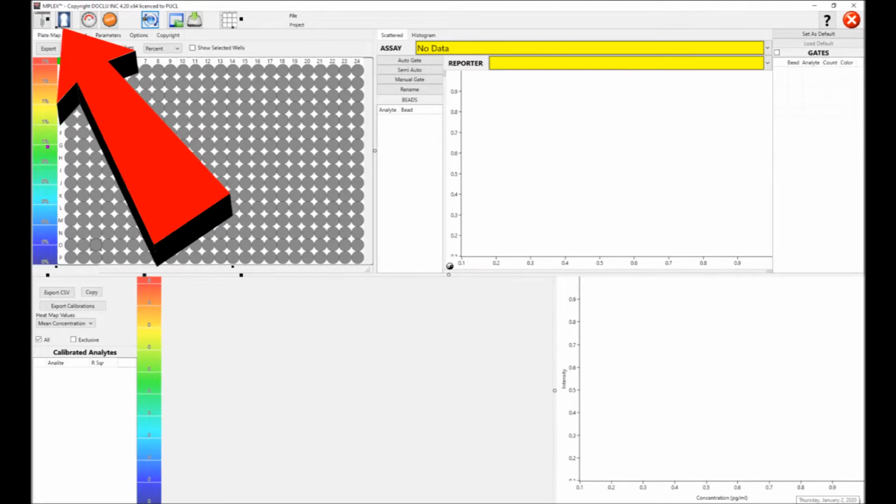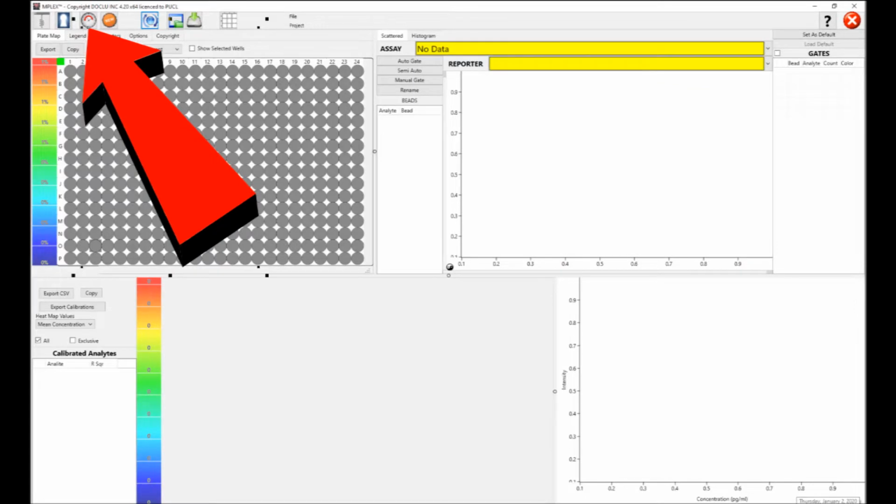The second icon is the eye. If one eye is open, you can load a small portion of the file, very useful for large files when setting up protocols. The time clock shows the history of loaded files. You can just click on a previously analyzed file from here.